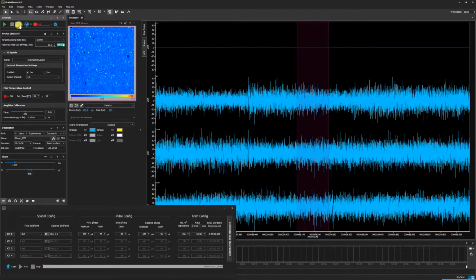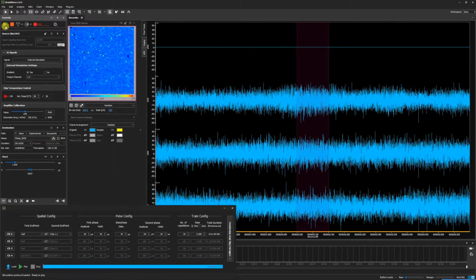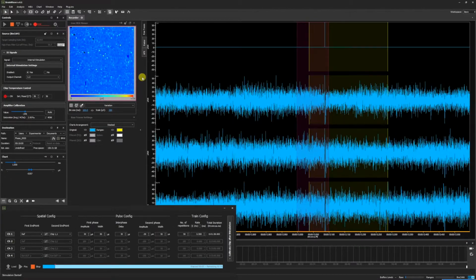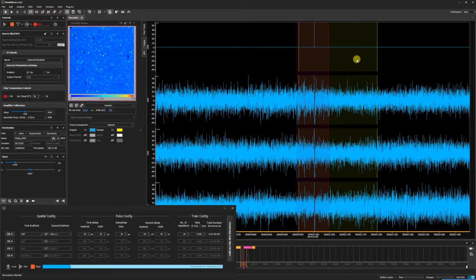To begin the basic stimulation, go to the stimulator launched in the Plugins menu and configure your settings. Once we have input our settings, click Load to send the stimulation protocol to the biocam. Now we can go back to the Controls window and click Play to begin live data acquisition. And once we hit play on our basic stimulation protocol window, we can see when the stimulation occurs. Stimulations are represented by the yellow intervals.